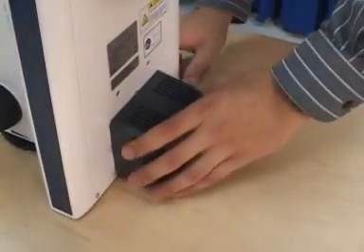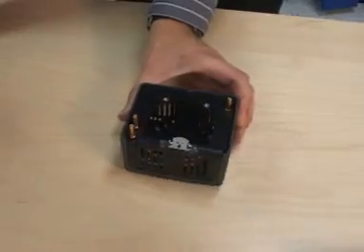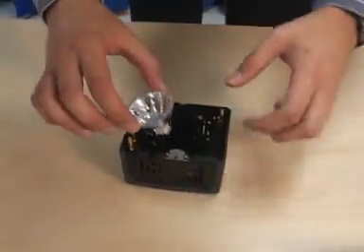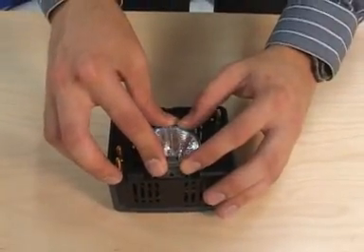Install the 50-watt halogen projector bulb by simply pulling the halogen lamp housing straight back and out of the connectors in the scope. Insert the bulb and push the lamp housing back into the connectors, making sure it is flush with the back of the scope. No alignment is needed.